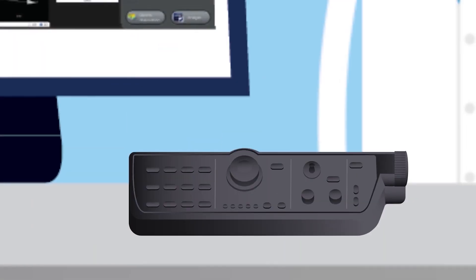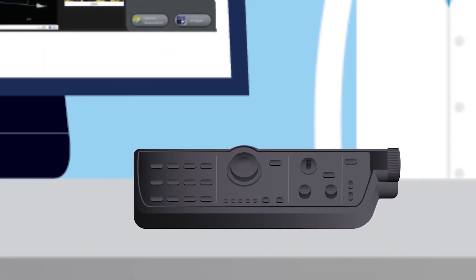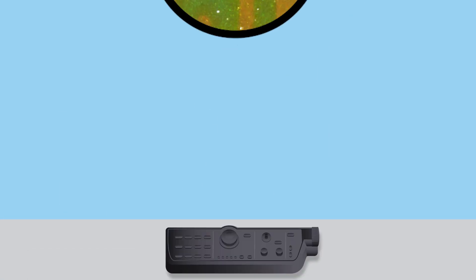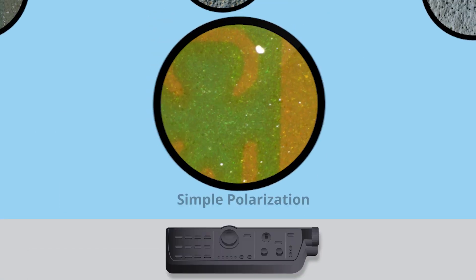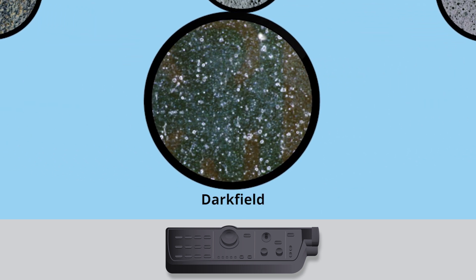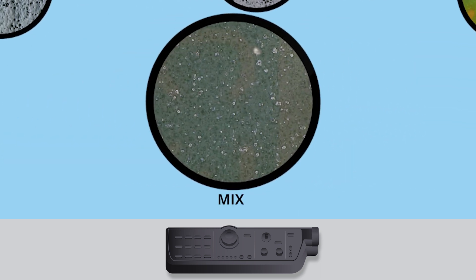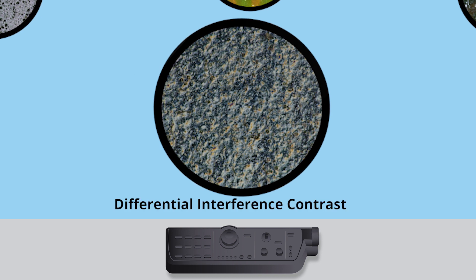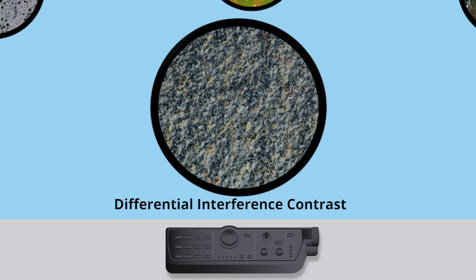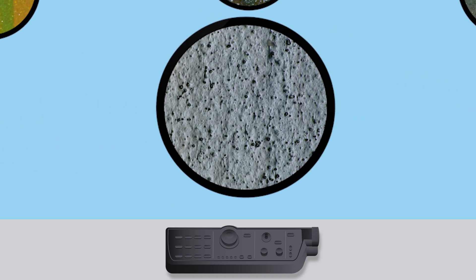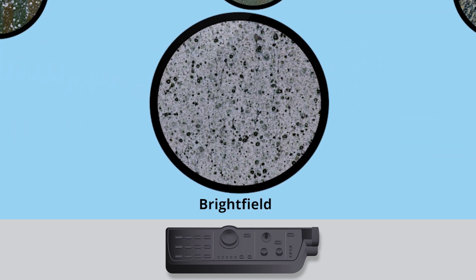The easy to use console allows you to switch between observation methods with a single click. Quickly and easily transition between simple polarization, dark field, mix, differential interference contrast, oblique, bright field, and contrast enhancement observation functions.